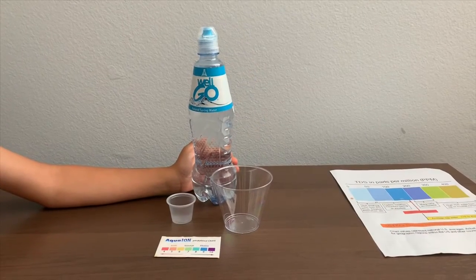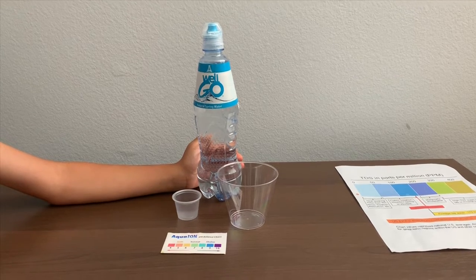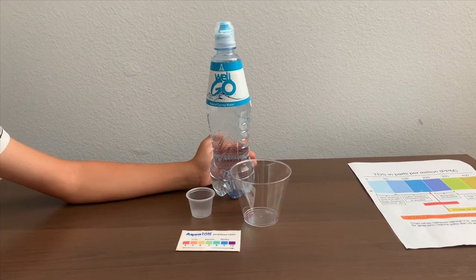This is Aranwell Natural Sprint Water, and it costs $1.50 and is sourced from Arminia. Let's test the pH and TDS levels.